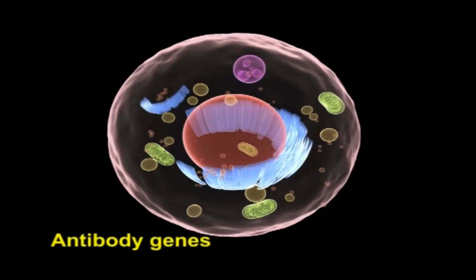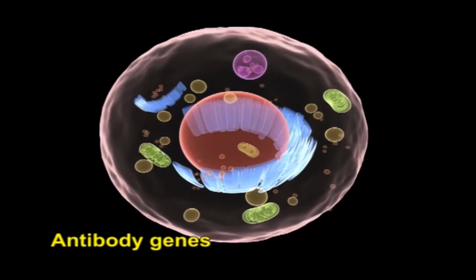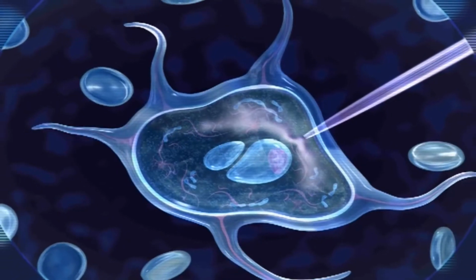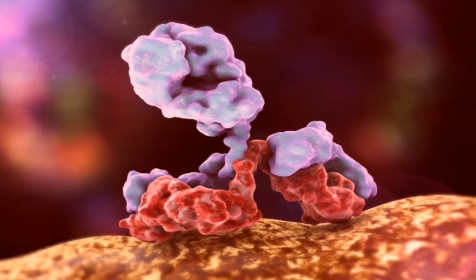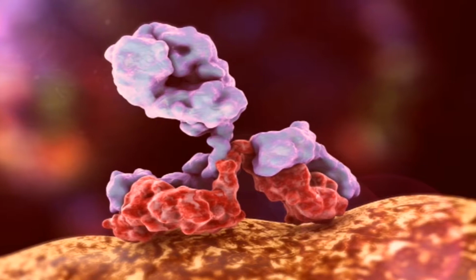In recent years, the antigen binding sites of the antibodies have been studied in some detail, which led to the modeling of entirely new antibodies, which is sometimes for their use as enzymes. For alteration of the antibody genes and for the synthesis of entirely new genes, this modeling by computer graphics can be used. These genes could be cloned and expressed in the bacteria. The antibodies synthesized can be tested for their specificity and their affinity for the specific antigen.